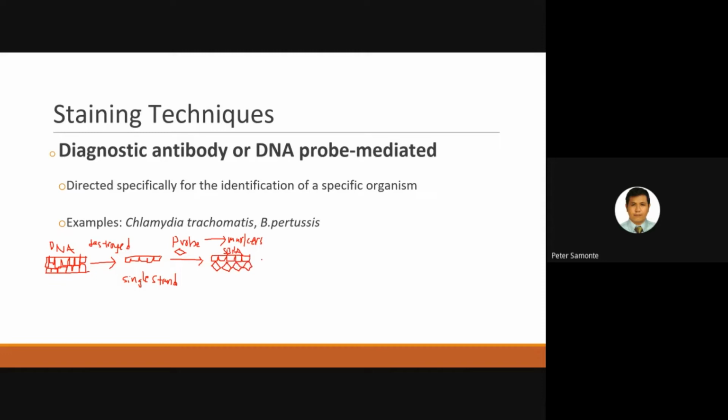Now they would attach that. After attaching, class, you would stain them, and that would allow you to identify them. Let me show you a better example.